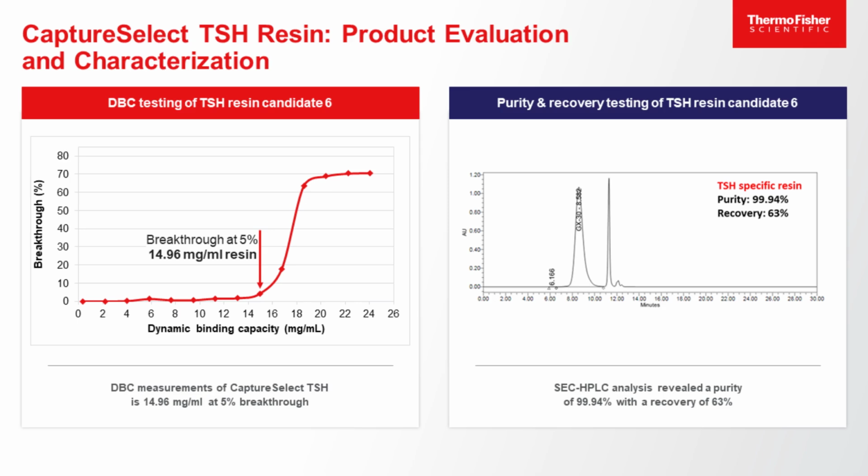And on the right-hand side, the purity analysis, showing that on SEC HPLC, the purity is higher than 99%, with a recovery of about 63%.